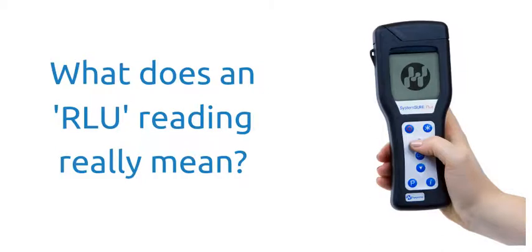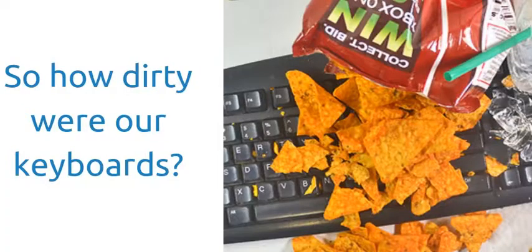So what does an RLU reading really mean? Acceptable RLU levels are dictated by each industry. For instance, a hospital's RLU levels would be lower than say an office or a school. To put this in some context, a hospital may have pass or fail indicators set at 10 up to 30 — anything 10 or below is a pass, anything 30 or above is a fail. These are the results.